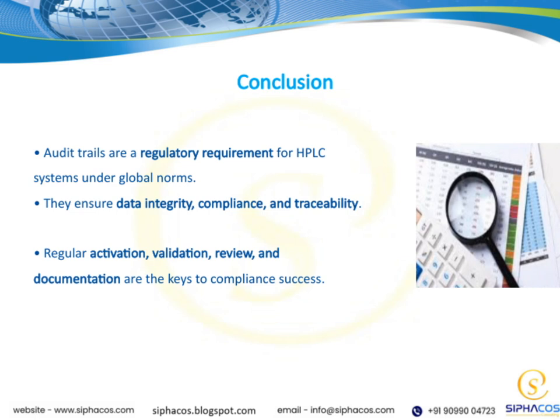To achieve and maintain this level of compliance, it's essential to regularly activate the audit trail functions, validate that they are working correctly, review the records periodically, and document everything thoroughly. These steps are the keys to staying compliant and ensuring the integrity of your data over time. Remember, consistent attention to these practices not only helps meet regulatory requirements, but also builds confidence in your analytical processes.